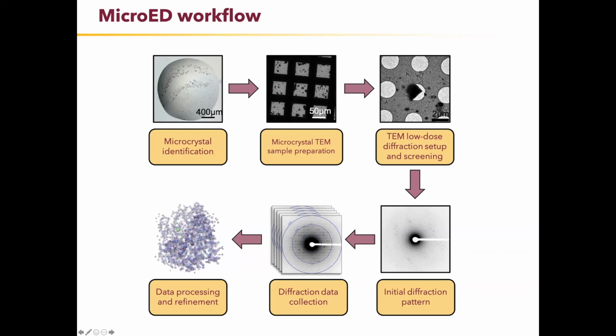You see here, here's a nice little crystal right here. I use this picture because you can see the nice sharp edges of the lysozyme crystal here. It is a bit misleading because the crystal happens to be in the hole, and that's not necessarily a requirement. Most of the crystals we shoot are actually not over the hole, they're on the carbon, and that's fine. But you can see here, this is a little tiny crystal. It's about 1 micron by 2 micron, maybe 200, 300 nanometers thick. And you're going to collect data from this crystal.